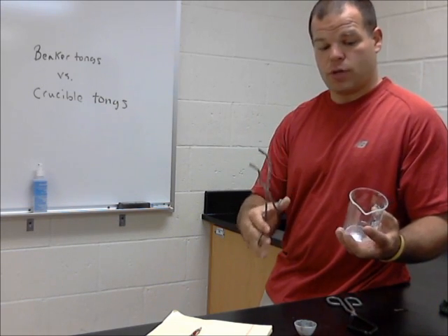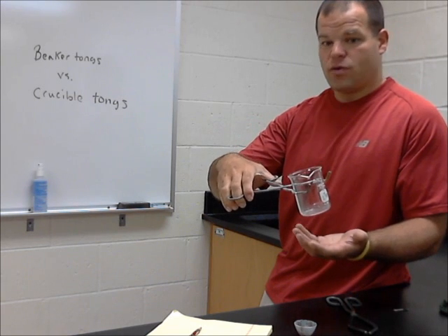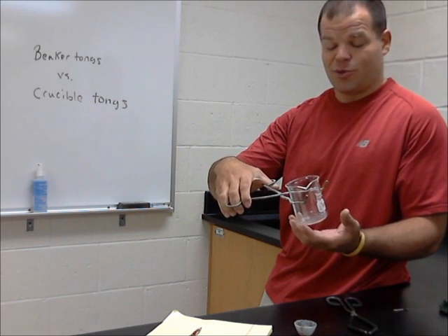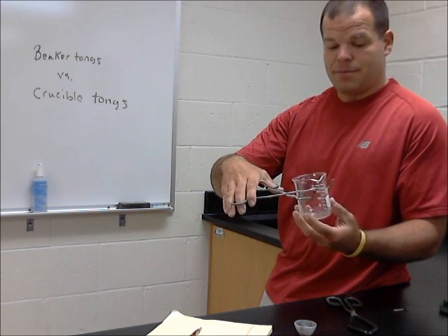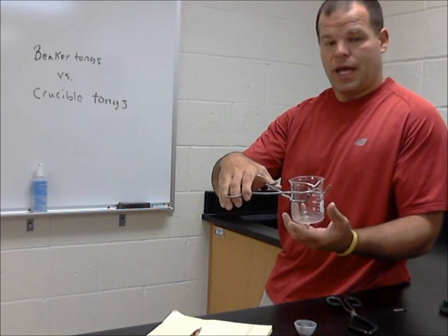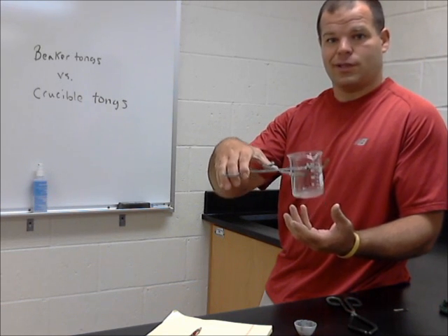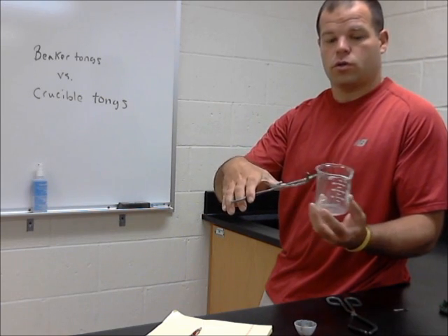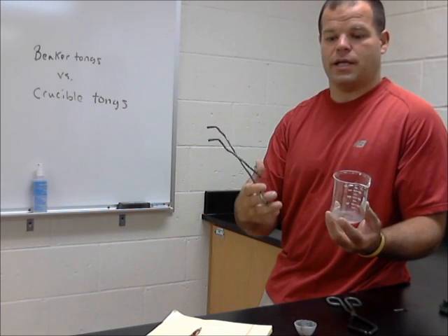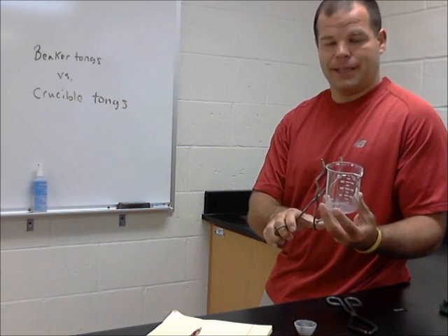Well, this is the main problem: sometimes it works. If it never worked, people would learn quite quickly that it's obviously not going to work. But sometimes, yes, it might work, but it can also end poorly for you. If there's some hot scalding liquid here, we don't want to take a chance that it's going to slide out or fall. I do not want to see a person using crucible tongs on a beaker.